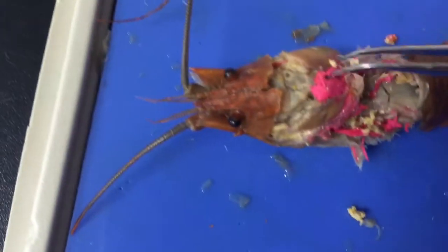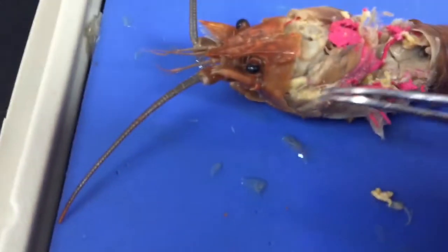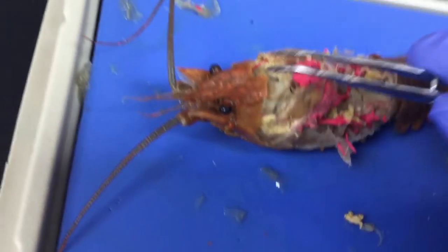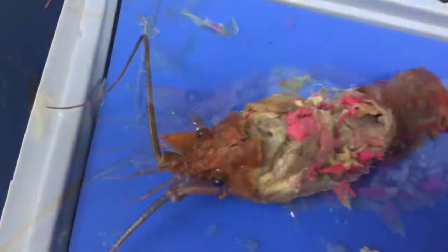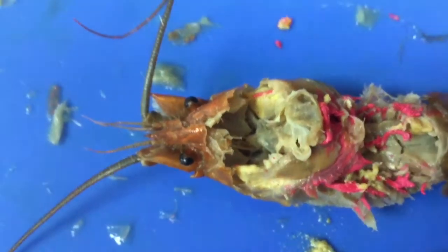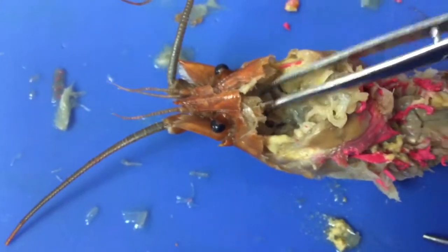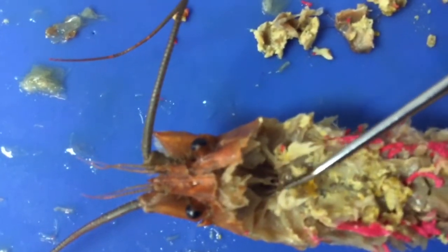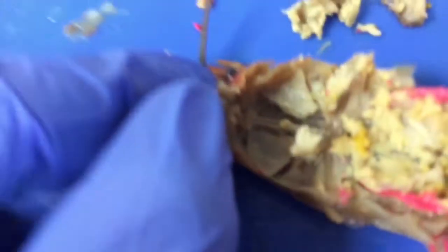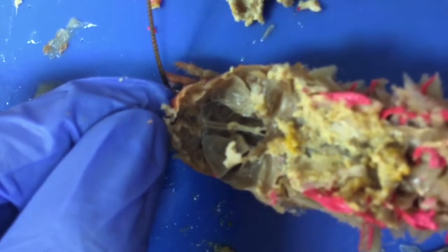Okay, so this is the stomach. And that green gland that you saw is right there. And the brain is up inside here between the eyes. Okay, so we've pulled the stomach back. And you can see down in here is the esophagus. Maybe you can see, I removed the stomach. You can see these lines here. These two little lines are the nerves. There's a tiny mass of white tissue, the brain, in there. Maybe you can see it.